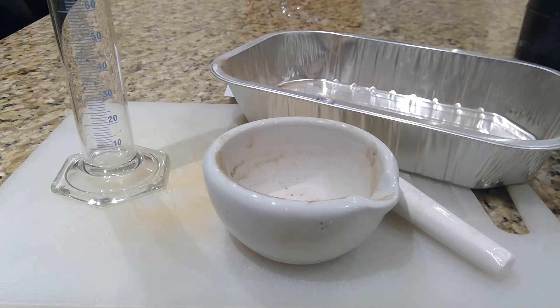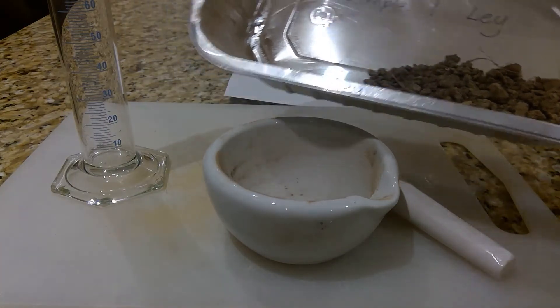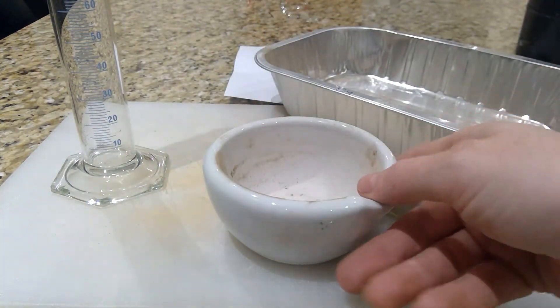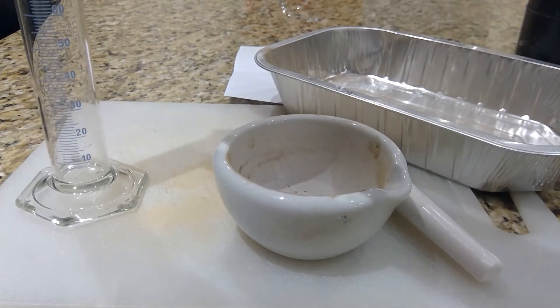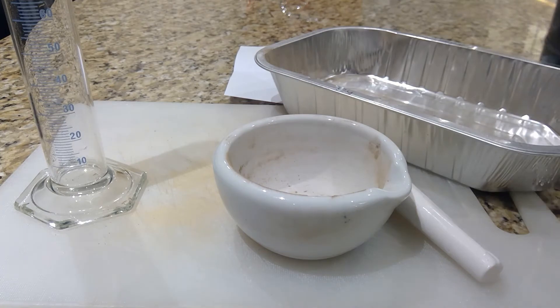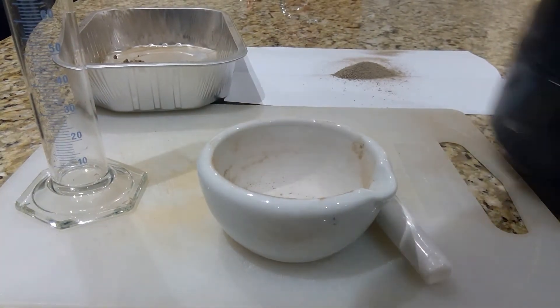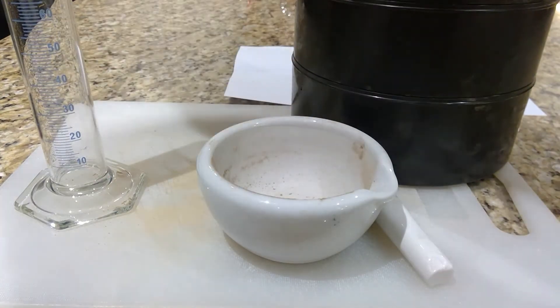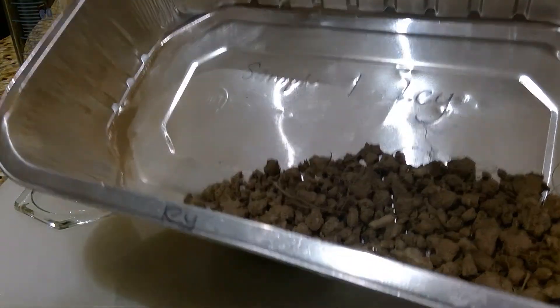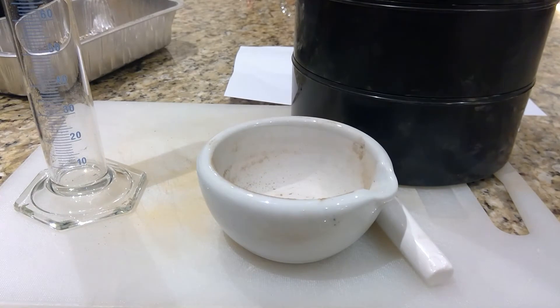What you need for this experiment is your soil sample — this is the sample I've been using for the previous two experiments — a pestle and mortar, a graduated cylinder, and a soil sieve. I dried out my soil sample in the oven at about 105 degrees Celsius for about 20 minutes.